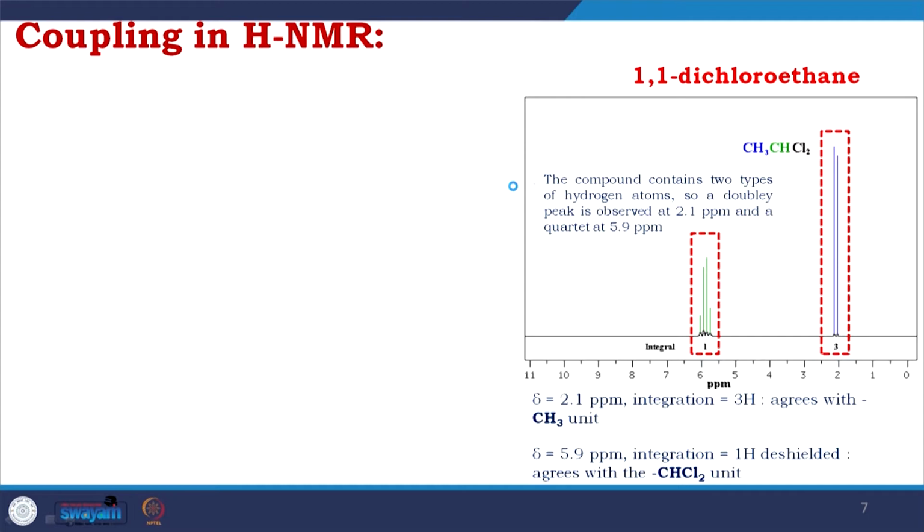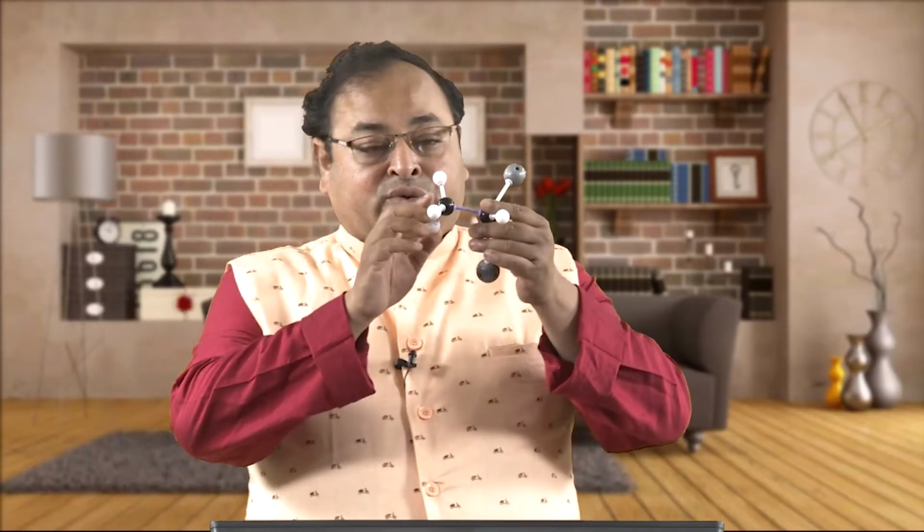So, if you look at, we have a compound which is CH3CHCl2.